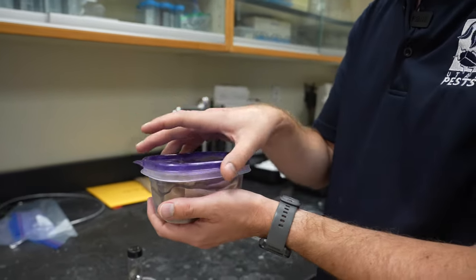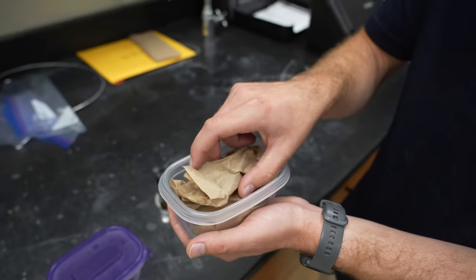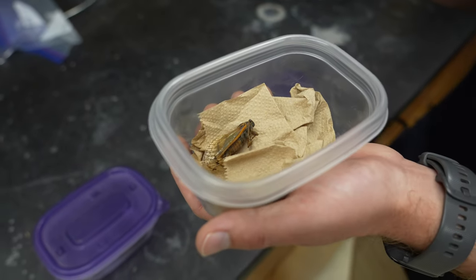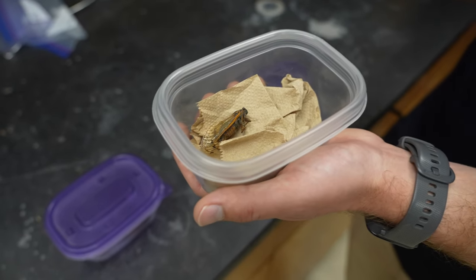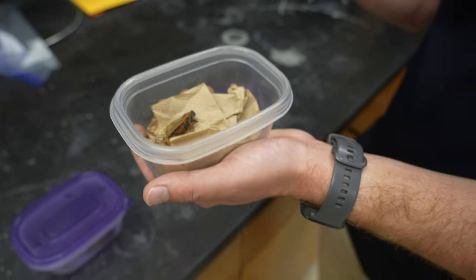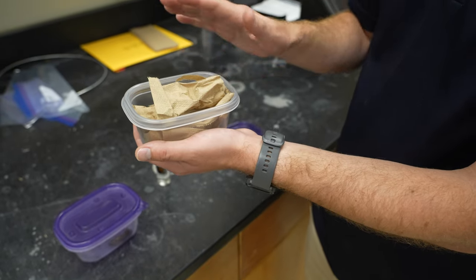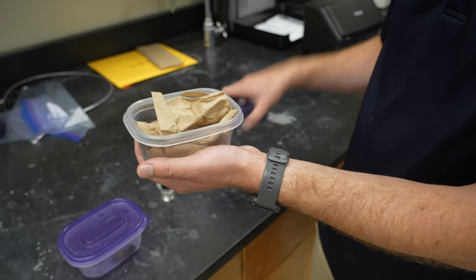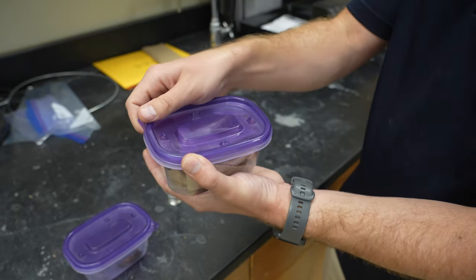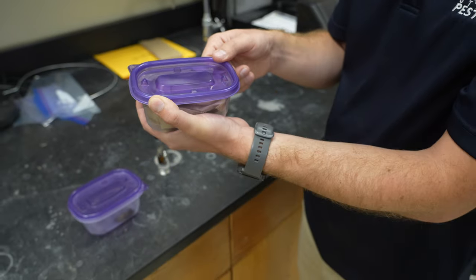The other way, if you don't have rubbing alcohol or a watertight container available, is to gently compress the insect inside paper towel, tissue, or some other paper product. Create a small bed of paper material and gently place another paper towel on top so the insect can't jostle around in the mail, then seal that container and put it in a padded mailing container or envelope for shipping.